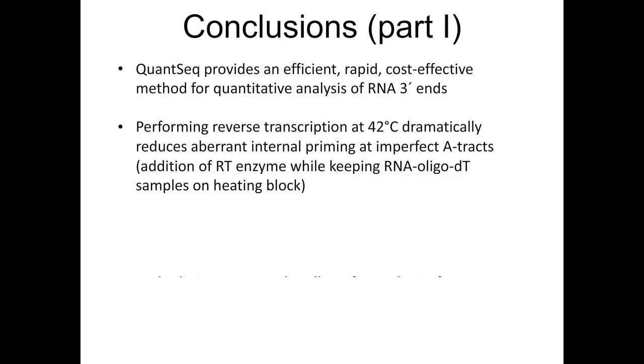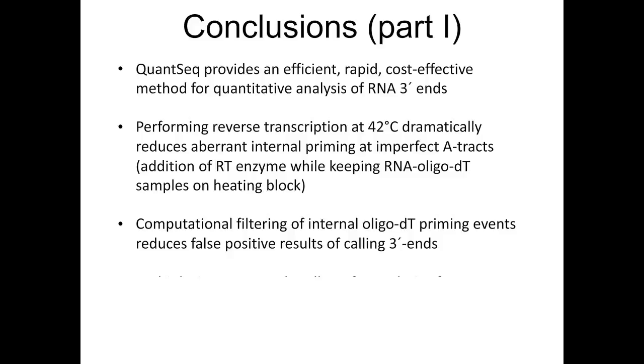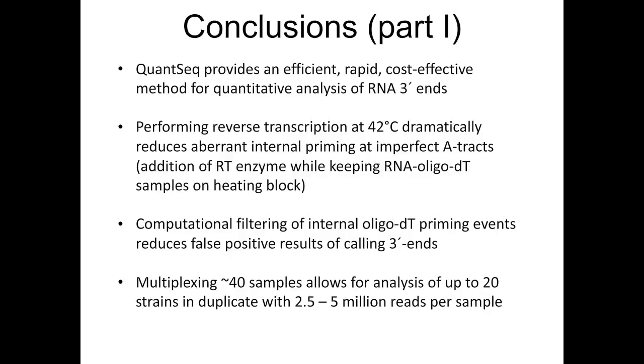And a key point here is that the samples need to be kept on the heating block during the addition of the reverse transcriptase enzyme. We developed a computational filtering method that's consistent with other methods, but we added specific upstream filters as well to remove the artifacts from the poly T reads and to reduce the false positive results of 3' end identification.